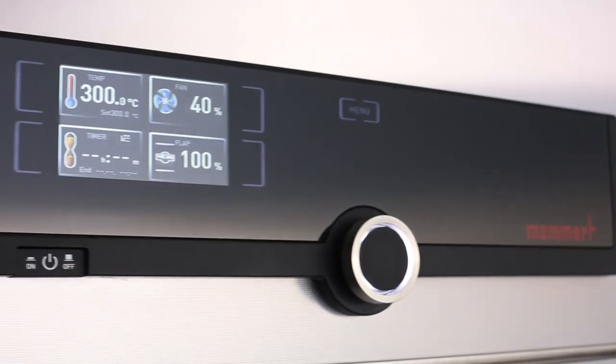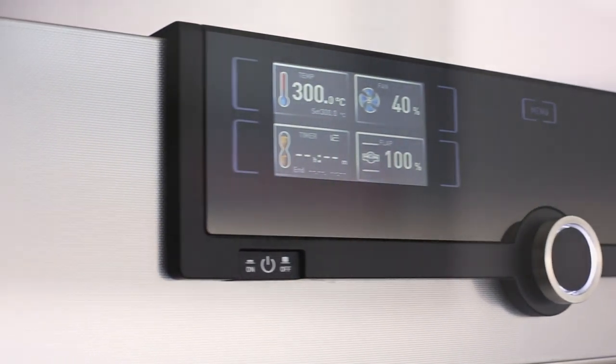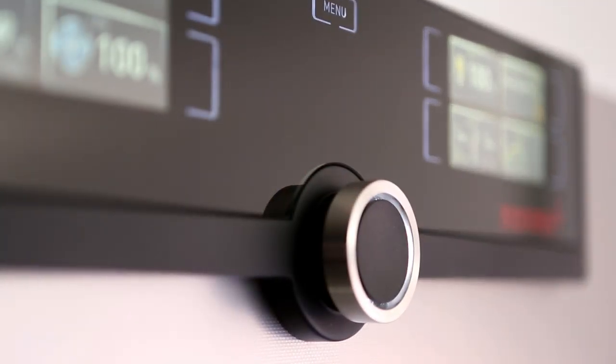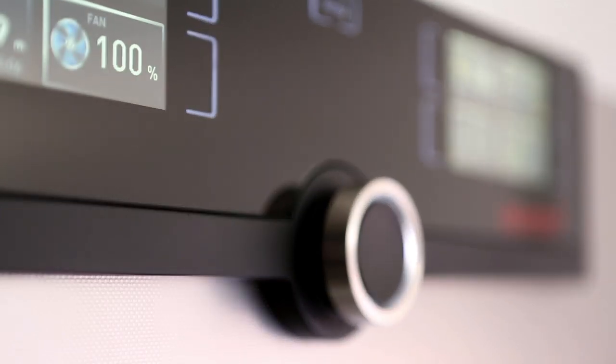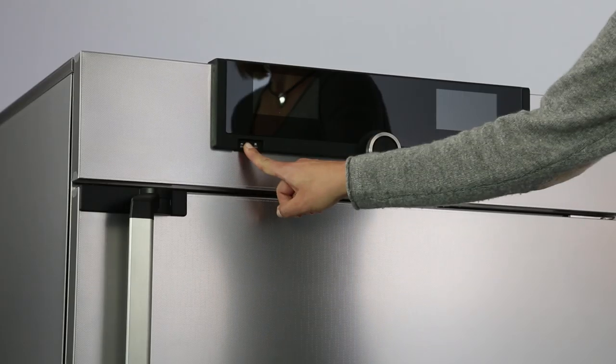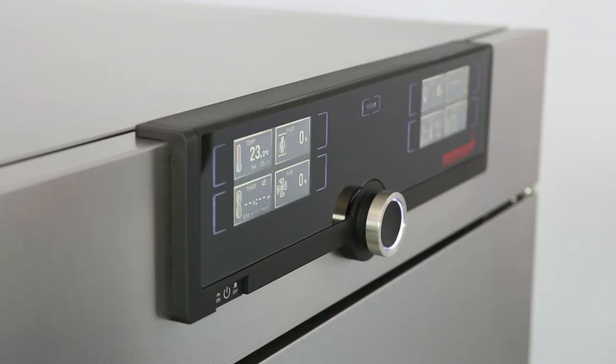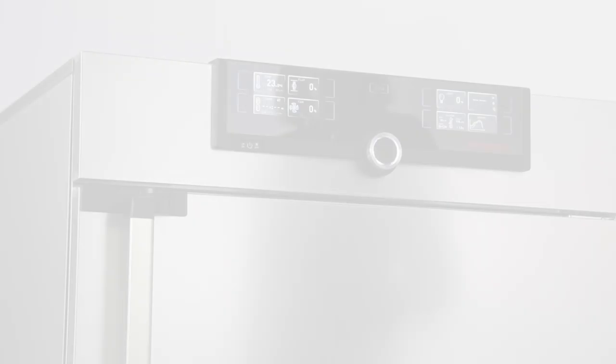Intuitive operation — fast, everything in view. The control cockpit of the new generation 2012 appliances gives you time for the things that really matter. Three quick steps and every function is ready. You prefer Fahrenheit or Celsius? There you go.